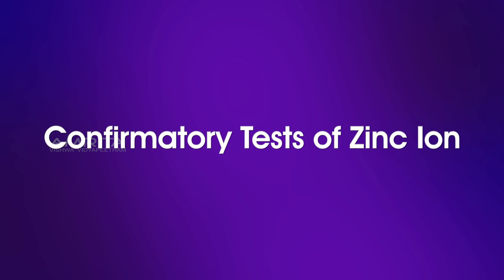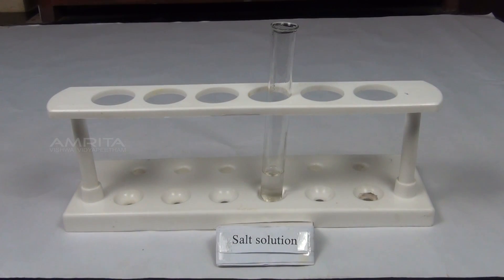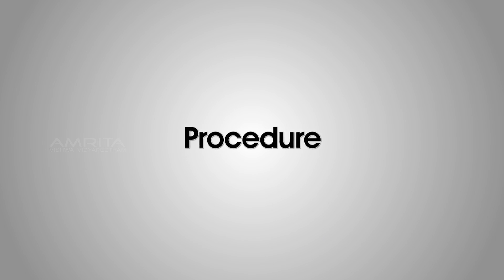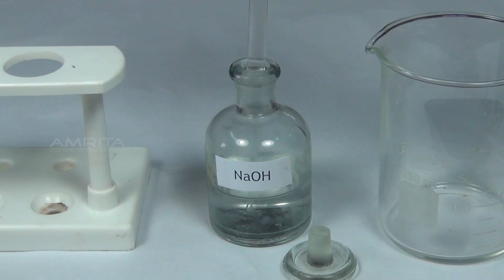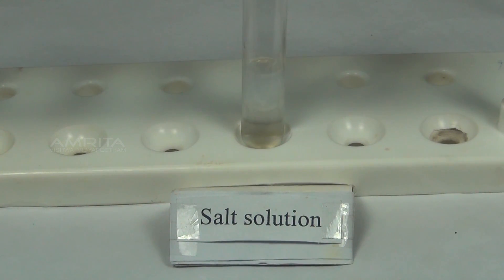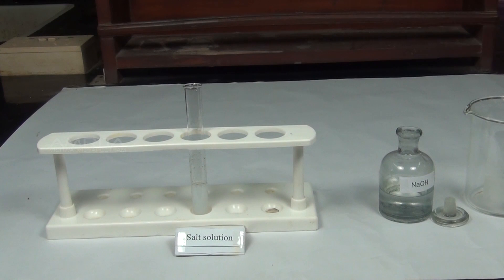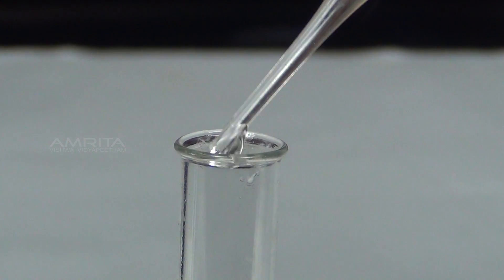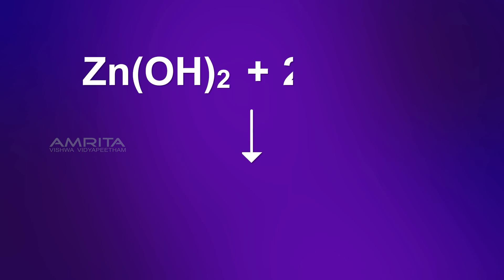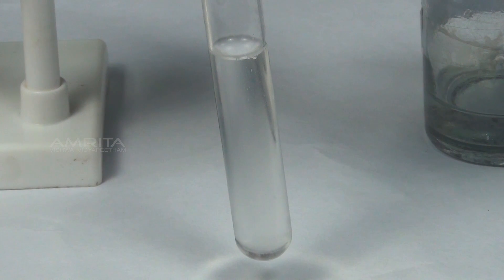Finally, we look at the confirmatory tests for salts of zinc ion. Sodium hydroxide test. Materials required: salt solution in a test tube, sodium hydroxide, and dropper. Procedure: Take a small quantity of sodium hydroxide solution using a dropper and add it into a small quantity of salt solution taken in a test tube. Zinc ions present in the salt solution react with sodium hydroxide to form a white precipitate of zinc hydroxide. Add excess of sodium hydroxide solution to the precipitate. The white precipitate dissolves because zinc hydroxide reacts with excess of sodium hydroxide to form soluble sodium zincate.